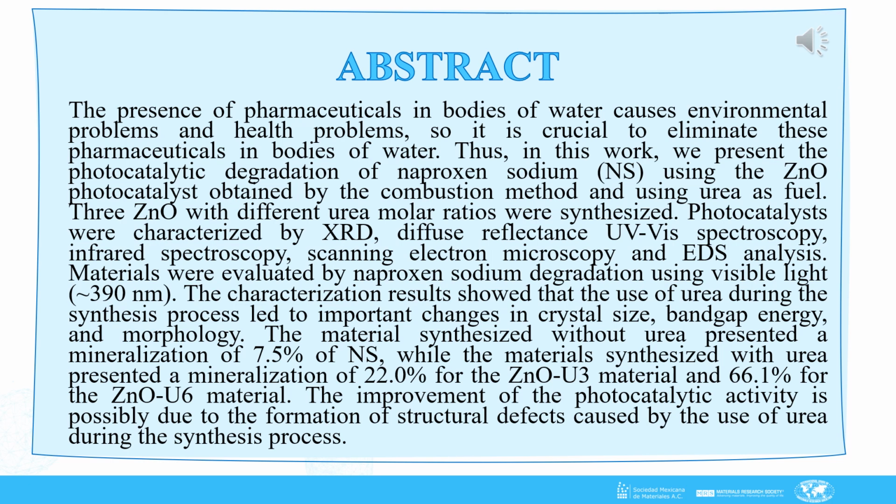Three zinc oxides with different urea molar ratios were synthesized. These photocatalysts were characterized by different methods, and the materials were evaluated by the degradation of naproxen sodium using visible light, approximately 390 nanometers. Later, I will explain the results of the characterization and evaluation.